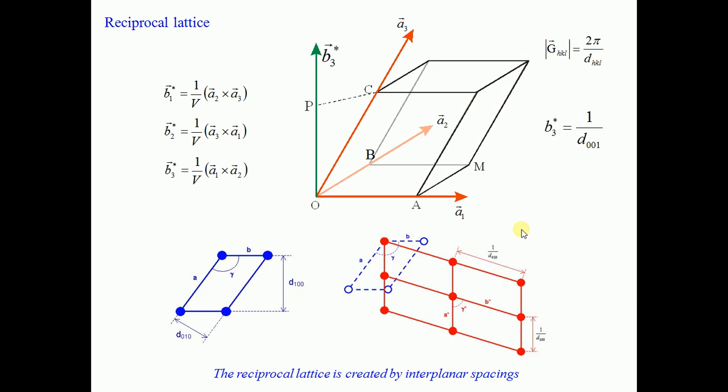For understanding how we get spots and how we get circular spots, we just touch on crystallography and a few aspects from solid state physics. One is the reciprocal lattice. When we say lattice and when we say reciprocal lattice, a lattice is the regular periodic arrangement of the atoms in 3 dimensions, we know. For example, let us say A1, A2 and A3 are the radius vectors, or vector directions, for the 3 directions of the lattice.